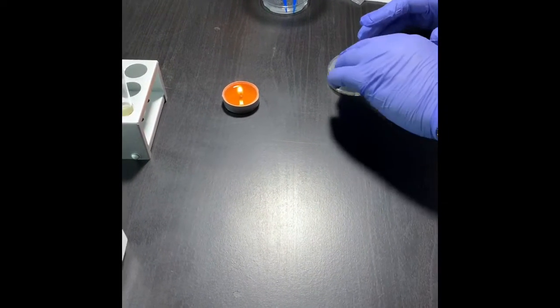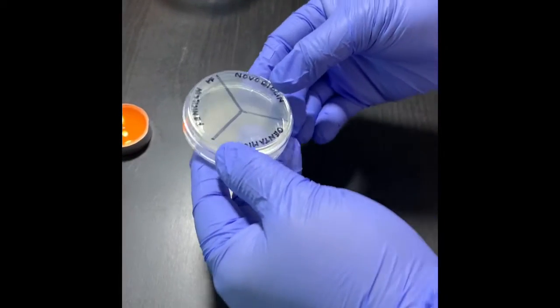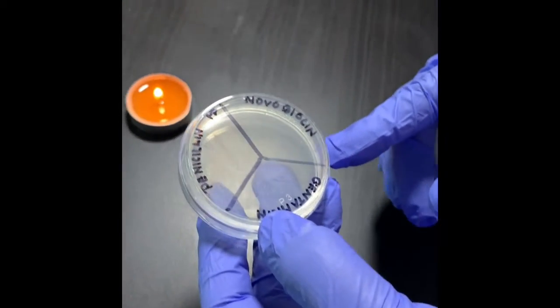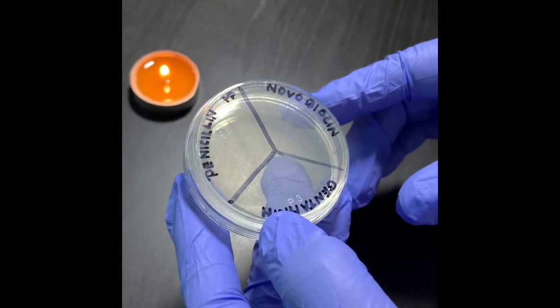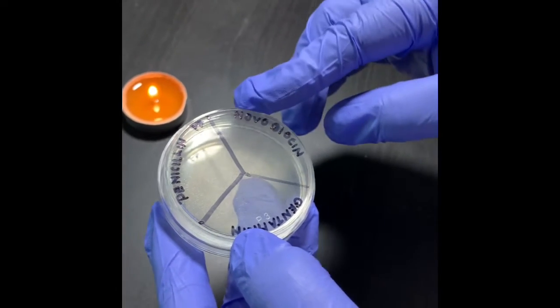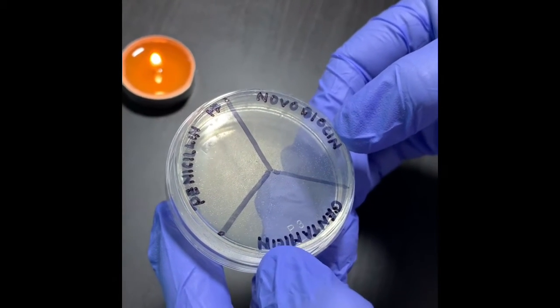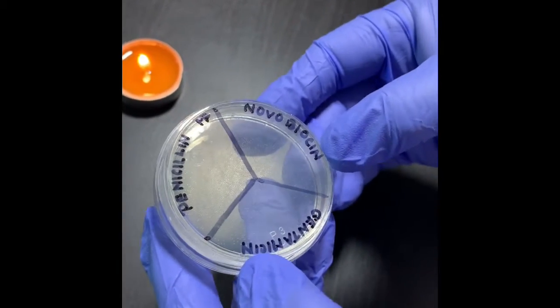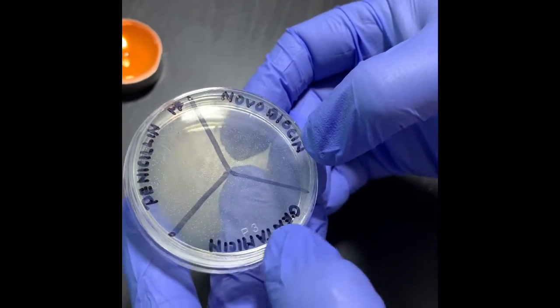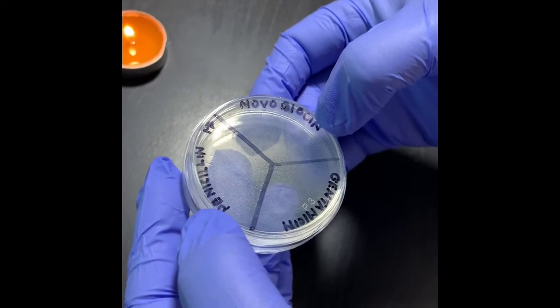For that I have taken this agar plate and made 3 quadrants, and I already labeled them. If you have seen the labeling at the edge, one section is novobiocin, another is gentamicin, and in the last section I marked penicillin.